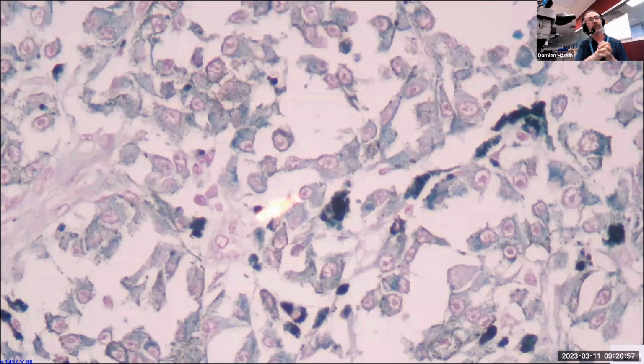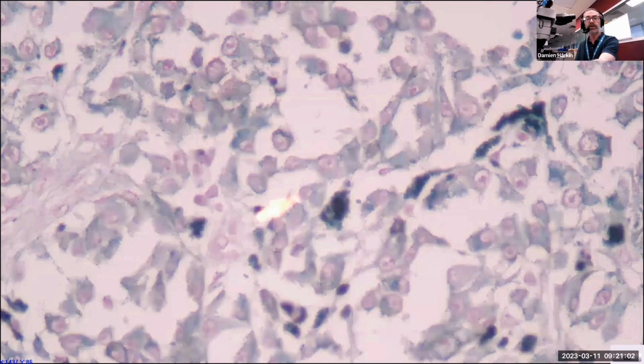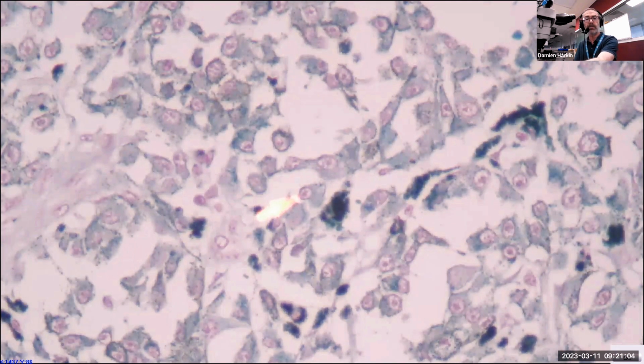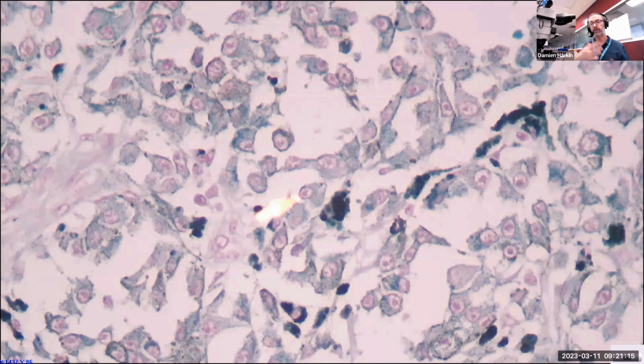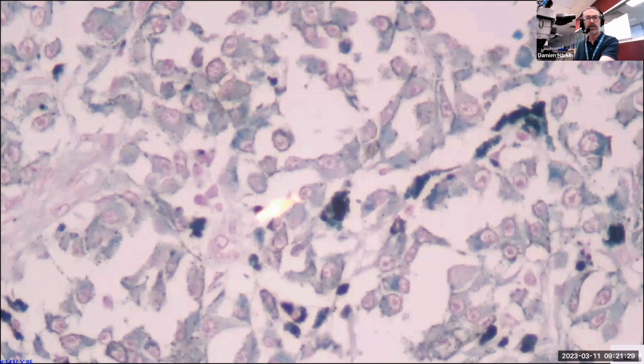And this complex of ferrous ferricyanide is this beautiful, intense, dark green-blue color that you can see here, otherwise referred to as Turnbull's blue. So it's a really elegant way to exploit the chemistry combined with cyanide salts, and ultimately using the properties of melanin as a reducing agent in order to generate this nice, vibrant color.